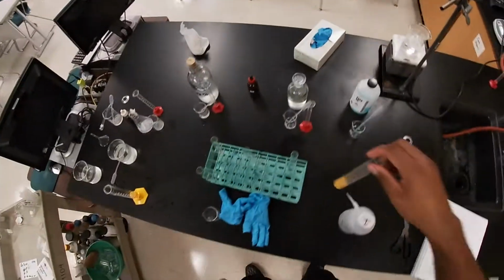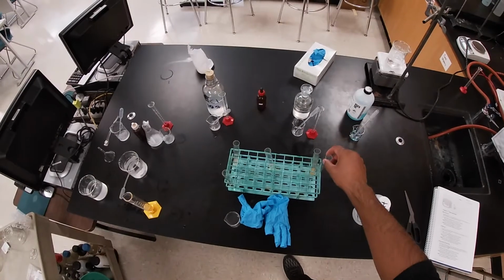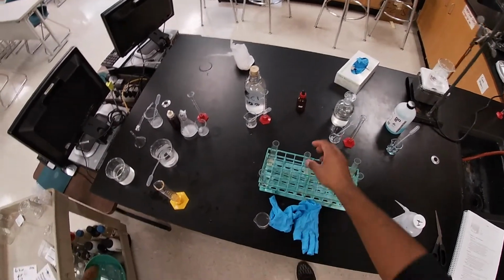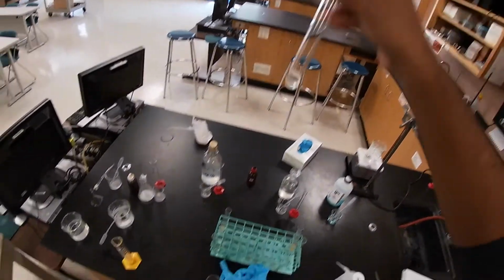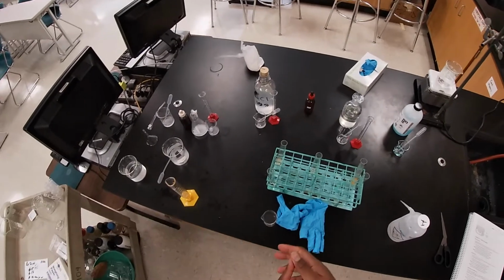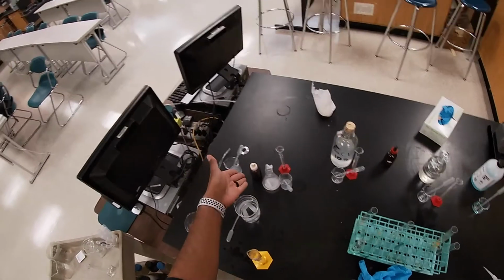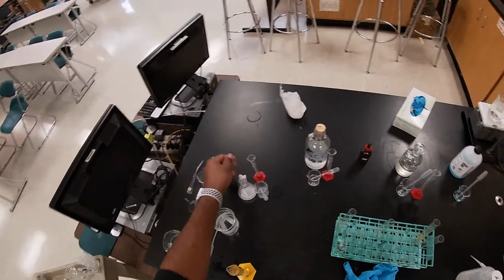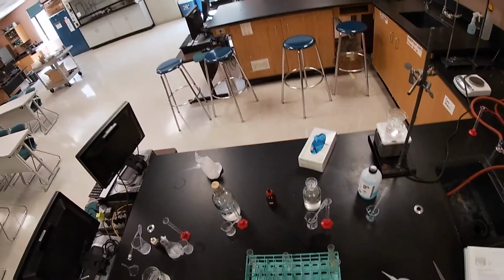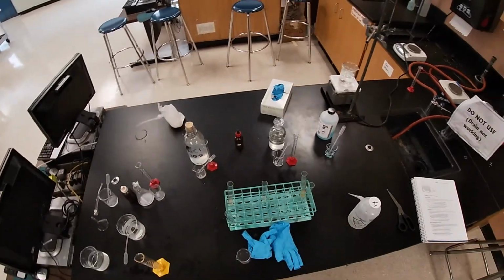Let's get our glucose determinant. And so remember that in this one, we're gonna put our Benedict solution so that we can test our solutions in a bit. So again, we have our precipitation that happened with silver nitrate and sodium chloride. So remember, we're gonna use silver nitrate to determine the chloride ion. We're gonna use iodine to determine the starch in the solution, and we're gonna determine that the glucose is present with the Benedict solution, okay? And we also gotta heat it up.